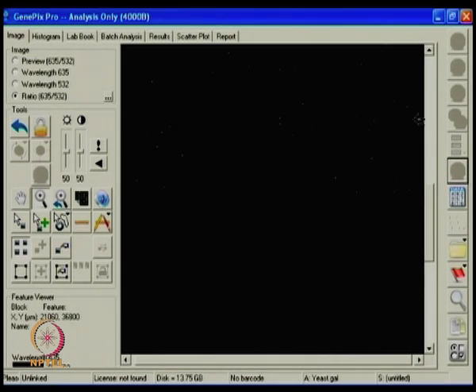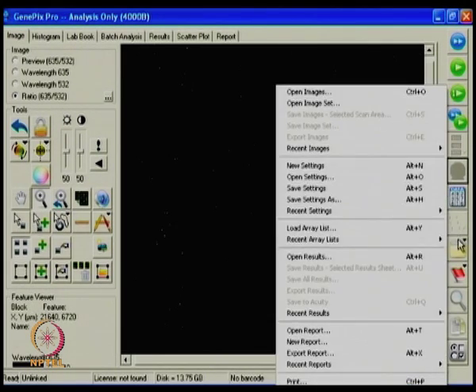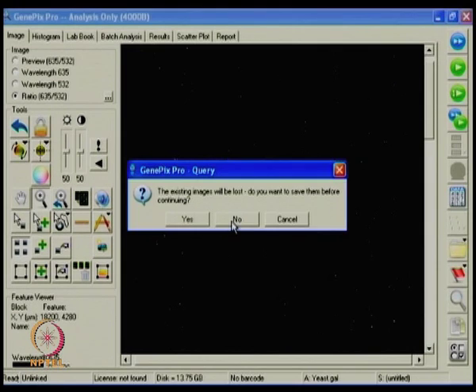So now, as the scanning is being performed, let's say I save the image, and once I save the image, I would like to see how the different processes are done. Say, for example, I have saved this image as, say, this is the east. So I just want to open the image which I have just saved.